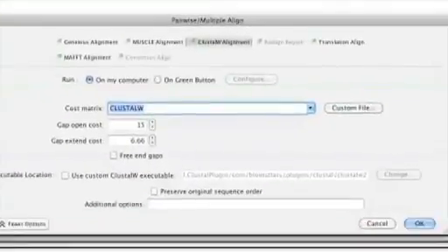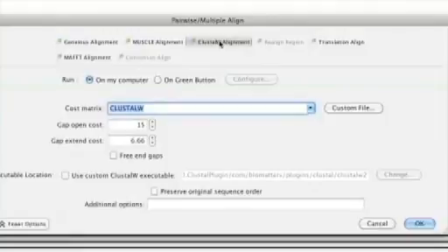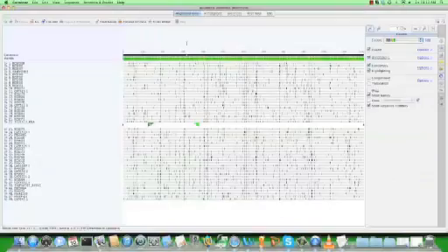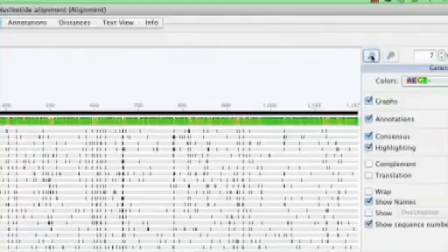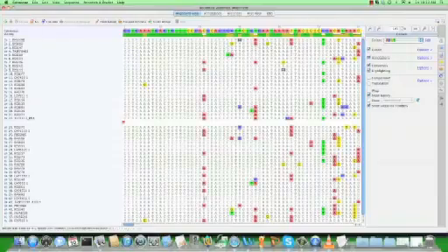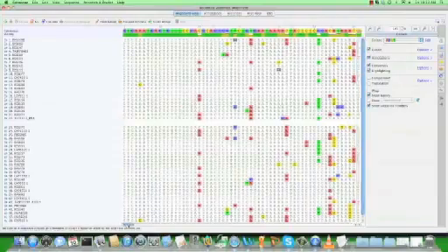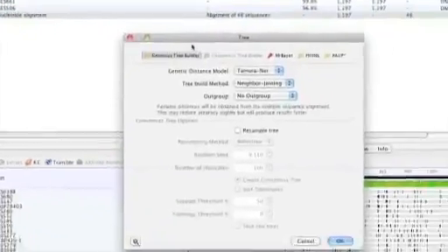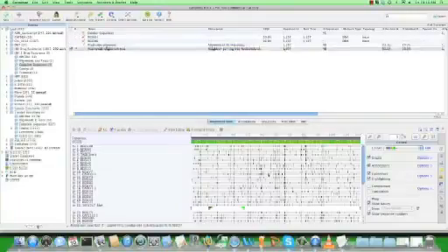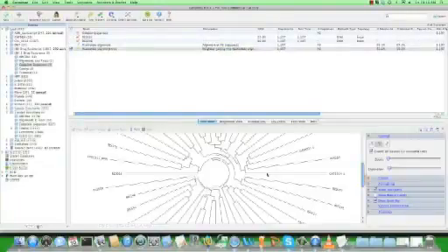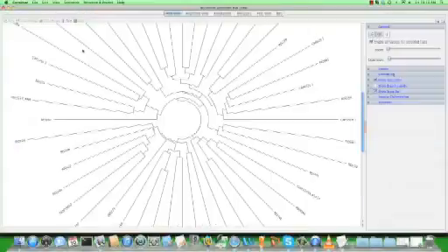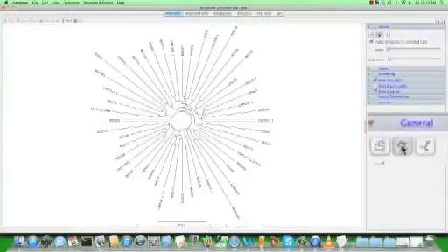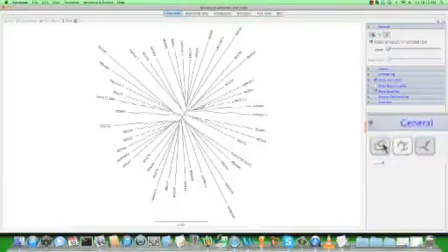Align all the sequences from the database using the ClustalW program in Geneious. Manually check the alignment for misaligned sequences, deletions and insertions and edit accordingly. Construct a phylogenetic tree using Geneious Tree Builder or other tree builders. Examine the tree for samples with short branch length. Review the samples with short branch length for possible contamination.